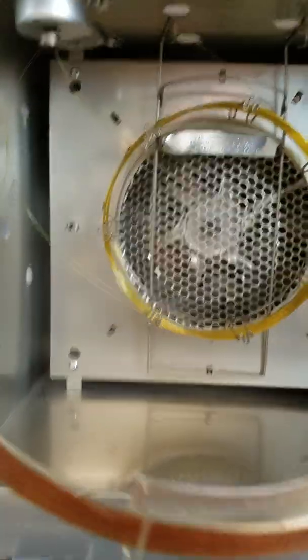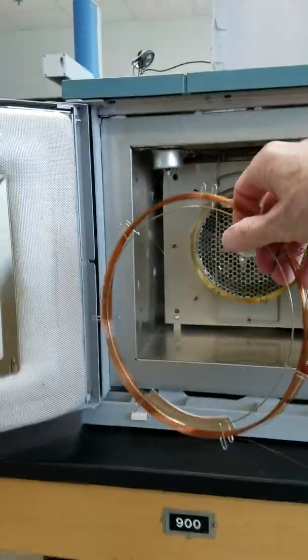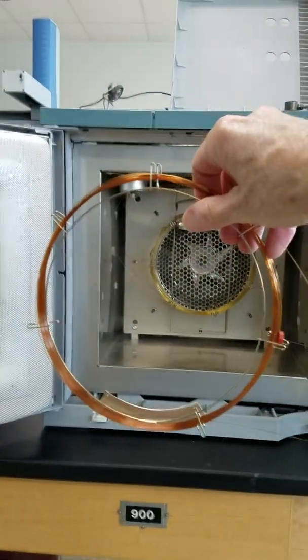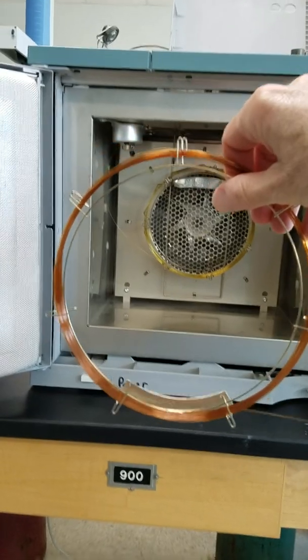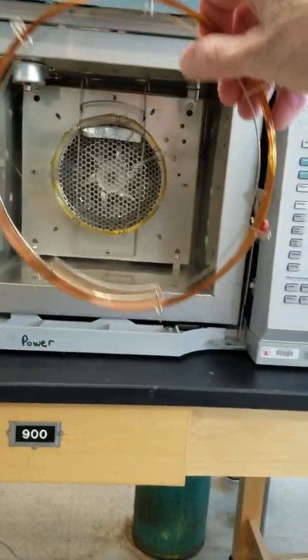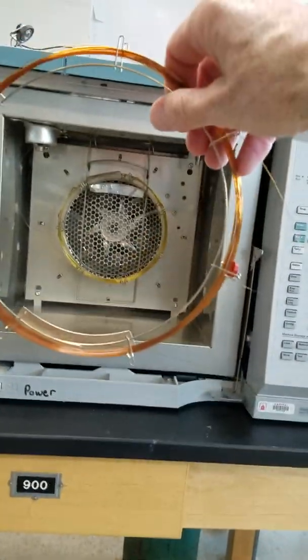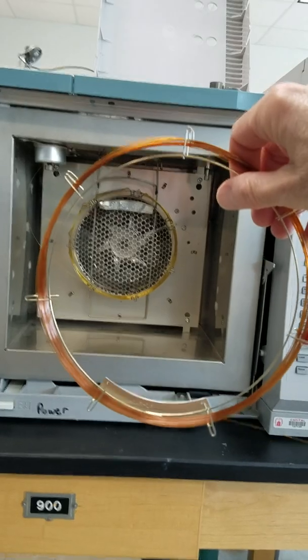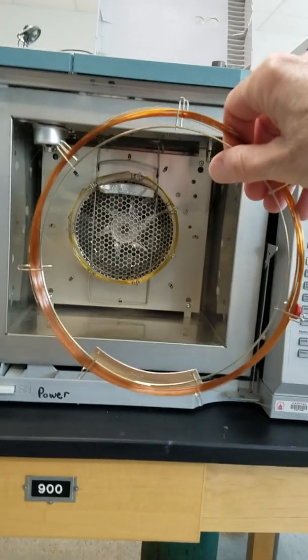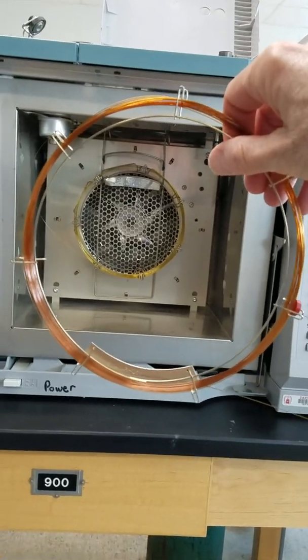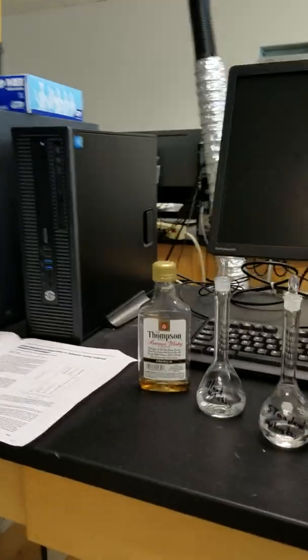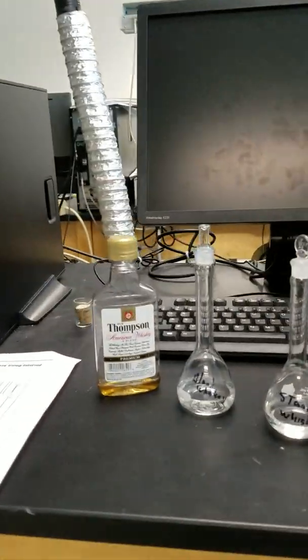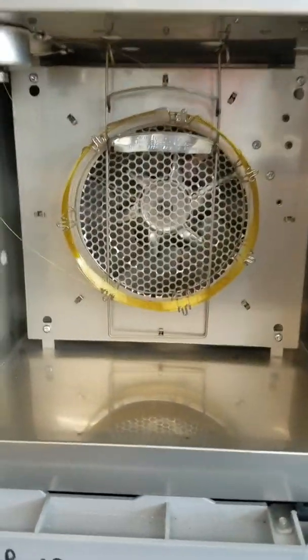We could take that column out. You disconnect it from the detector, disconnect it from the inlet, wrap it up, and then have a different column here like this, which is a non-polar column. If we were analyzing non-polar analytes, we'd put this non-polar dimethyl column into the oven and use that for the separation of analytes.